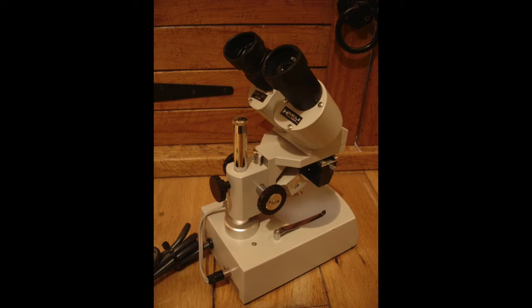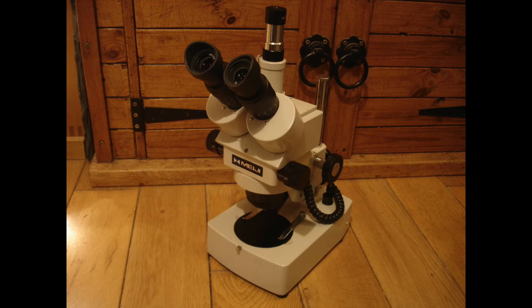This is a small Meiji Techno microscope, and Meiji Techno are really good — they're sort of as good as Olympus and Leica, that sort of high-end microscope. This one I picked up at a car boot sale for about ten pounds. All of the microscopes you've seen so far I've picked up at car boot sales. This is my main Meiji Techno microscope, and if you were to buy it new, I think it's between two thousand and two and a half thousand pounds.